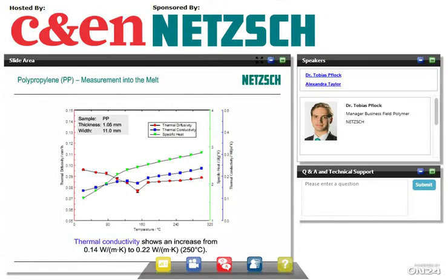Next sample shows you a semicrystalline sample, and this is polypropylene. And again, you see depicted thermal diffusivity in red, specific heat capacity in green, and thermal conductivity in blue. And we can see two things because we can see the melting. Melting shows up as the step in the specific heat capacity and as this, let's say, peak form in the thermal diffusivity.